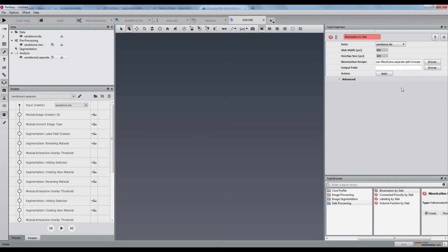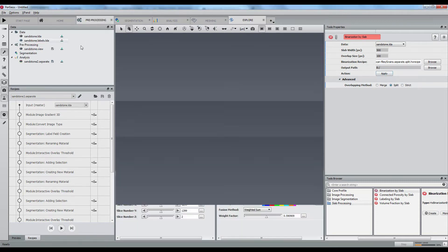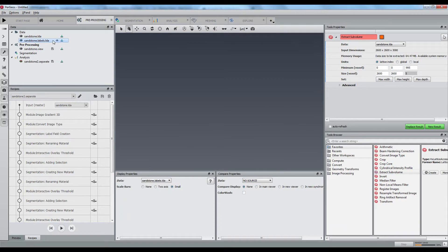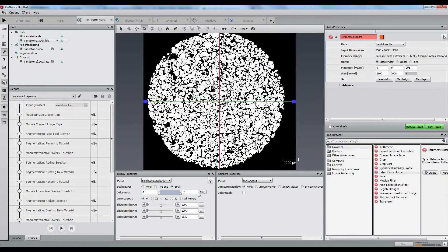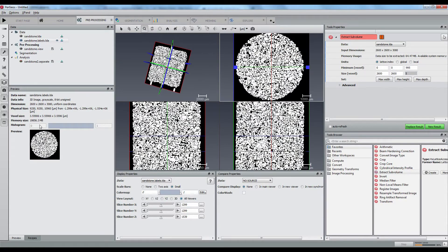The overlap size is quite high because we must ensure a grain is not split between two consecutive slabs. The overlapping method needs to be set to split because there is a separation step. It is then possible to check the results on the entire plug.